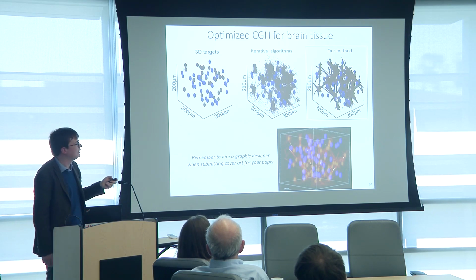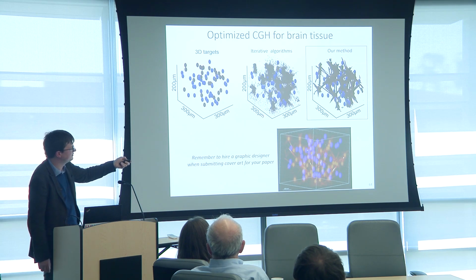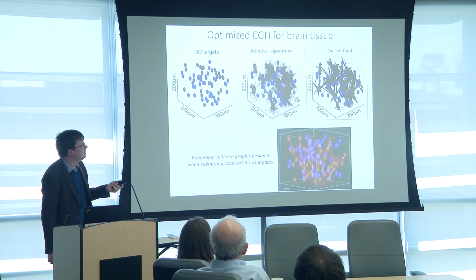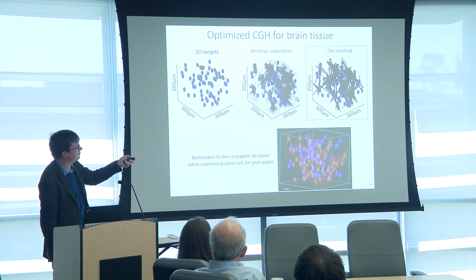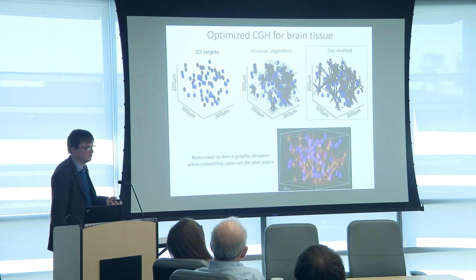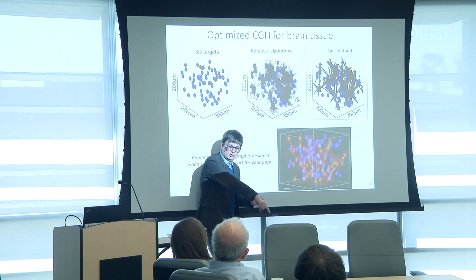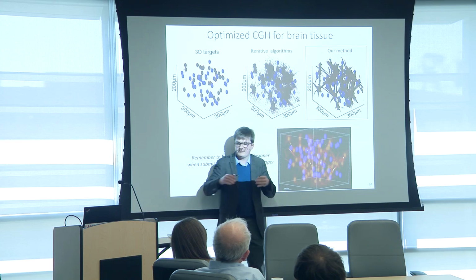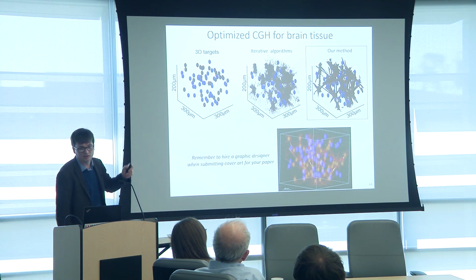the blue targets. If you do simple iterative algorithms, or if you don't refine your cost function, you can make holograms that look like this, that visually render the best approximation of the red target. But if you're willing to put the biological cost function in there, you create this very ugly hologram in which your algorithm basically attempts to shoot at the neurons by moving light along lines where the path is clear. Basically, for any photon that hits neither a red nor blue target, there is no cost.